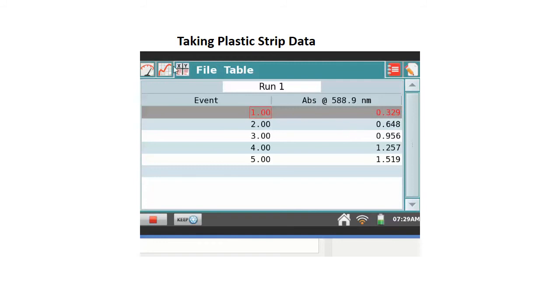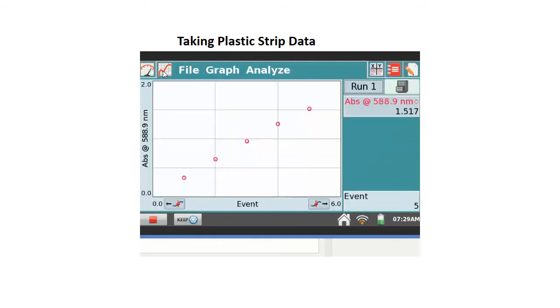Now what we want to do is handle the data statistically a little bit. In one of the earlier experiments, you became acquainted with hand drawing a least squares line, making a hand-drawn plot. We're going to use the technology a little bit here, before I move to Excel in another couple of weeks, to get the best straight line equation from these data that we can. And the way we do that is we go into where it says Analyze.